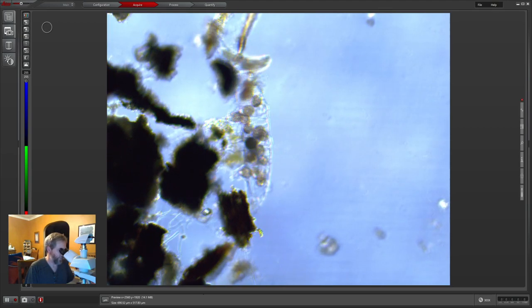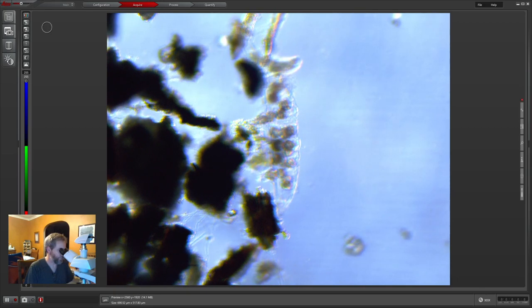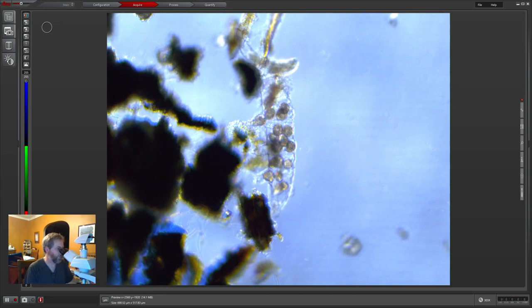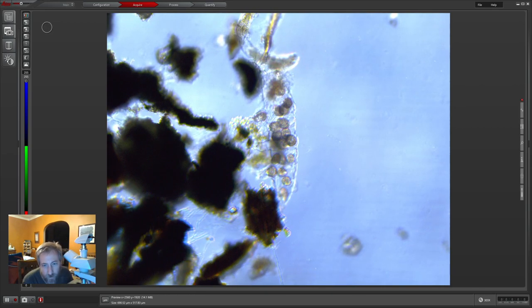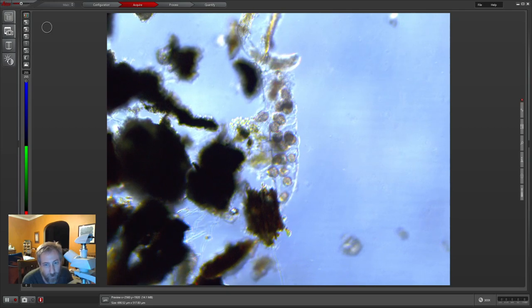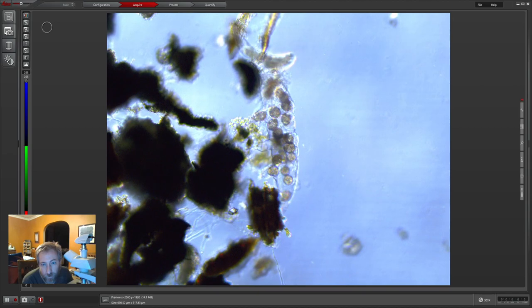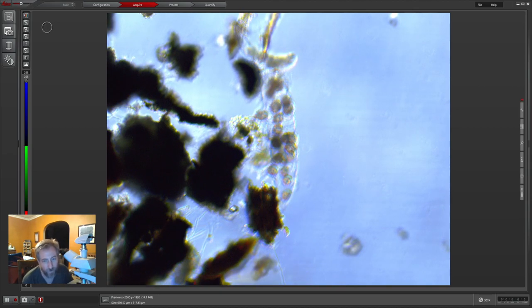I'm just playing around with this water bear sample I have. They don't look like ciliates at all — they're not really moving like ciliates either. They are moving around, but ciliates are usually a lot faster.